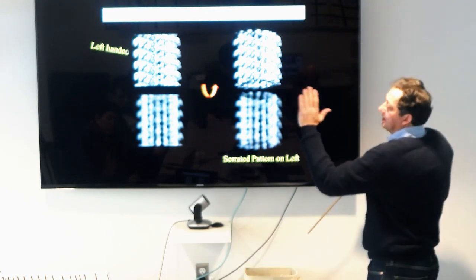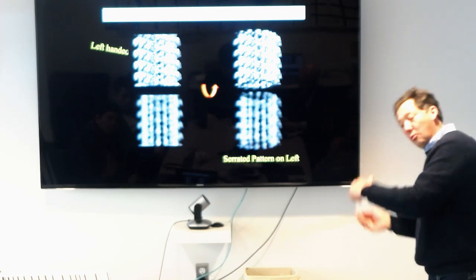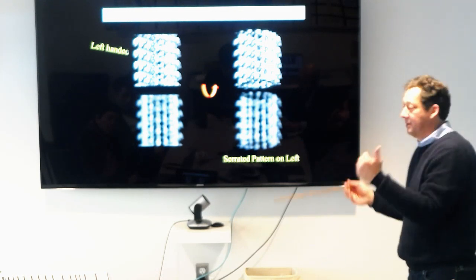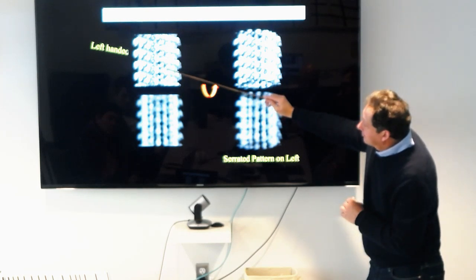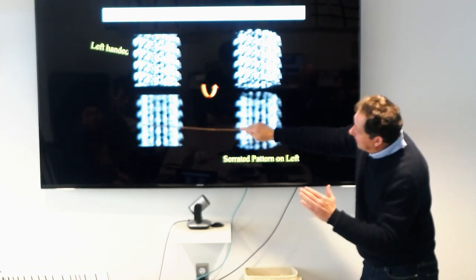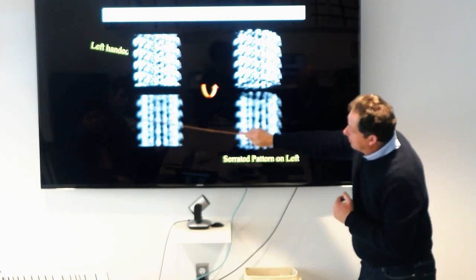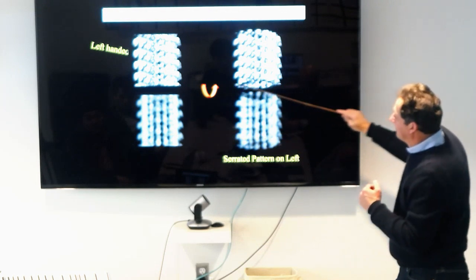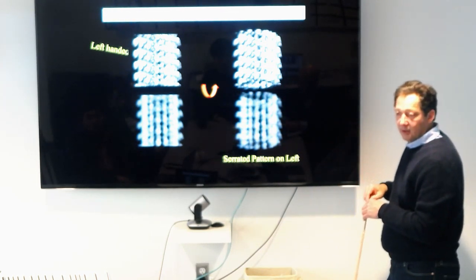And if I tilt the other way, it's actually the opposite, okay? And if you would have a right-handed helix, it would be the other way around, okay? So here is the projection. You see this helical path, when they go on the edges of the helix, you can see them clearly. But when I tilt it, this becomes fuzzy and this becomes very sharp, okay?